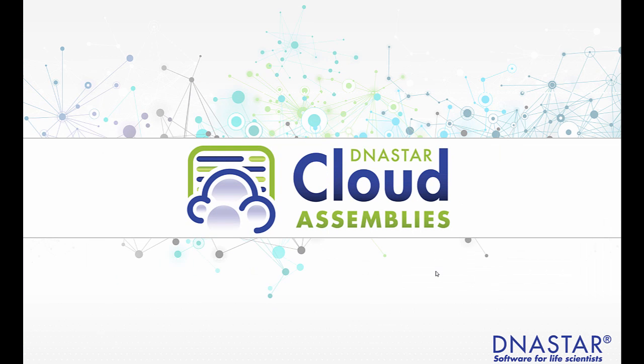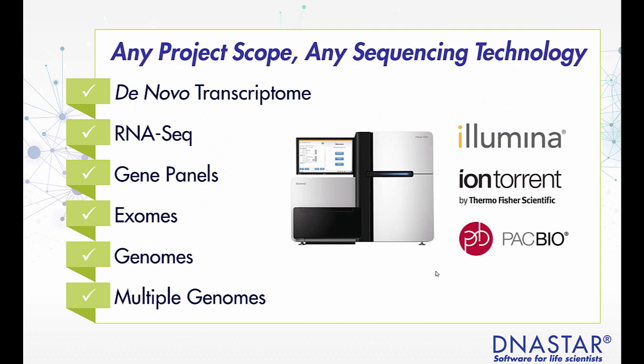So DNASTAR Cloud Assemblies, if you're not familiar, as I mentioned, supports all of the same workflows as our desktop computer. And that's everything from de novo transcriptome to RNA-seq, gene expression analysis, targeted sequencing projects like gene panels and exomes, cancer panels, full genomes, as well as multiple genomes. And the same goes for multiple exomes, multiple RNA-seq samples. So all of these workflows tie into our analysis tools where you can do things like variant analysis, multiple sample comparisons, CNV analysis, and gene expression analysis. And then in addition to all these workflows, we also, of course, support all the major sequencing platforms.